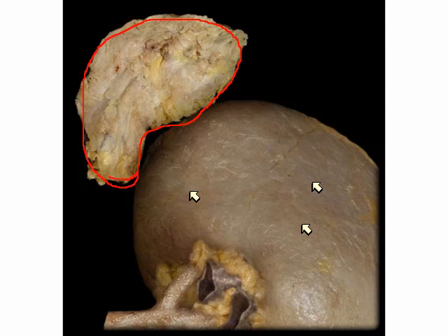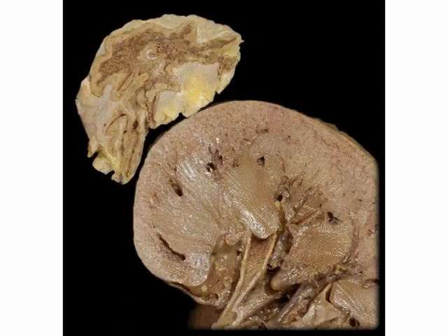Okay? It's like a cap on top of the kidneys. It really doesn't have anything to do functionally with the kidneys. It just is in that location right there on top of the kidneys. On a higher view, here you can see the kidney sectioned. You also can see the adrenal gland sectioned. And you see with this adrenal gland, there's a good bit of fat on the surface of it. So all of this light area, that's some fat and part of the capsule.